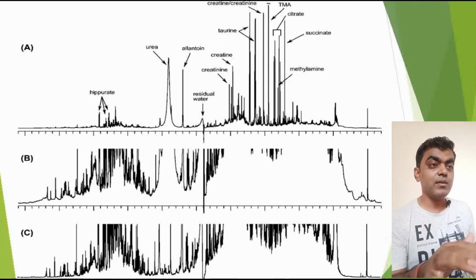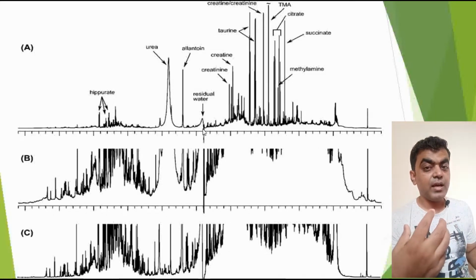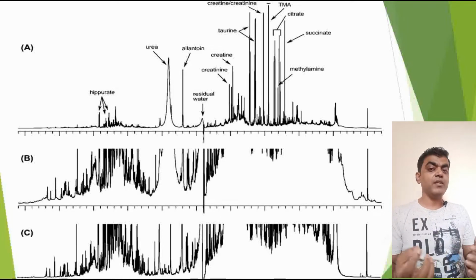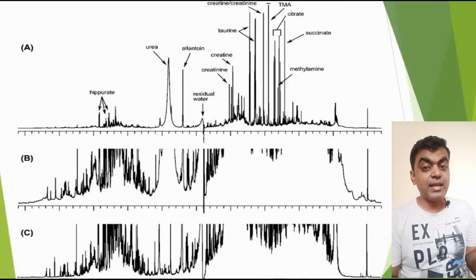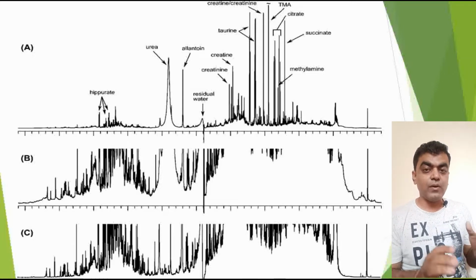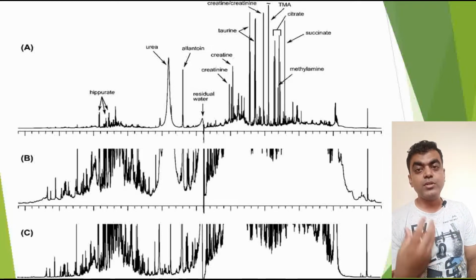So how do you get these small peaks? We know this is a water peak, this is a residual peak. This residual water is the water that your sample absorbs either from the air in terms of humidity, or by mistake if you prepare or dilute your sample in a water base, right? So to avoid this situation, what usually one does is use D2O instead of normal water.